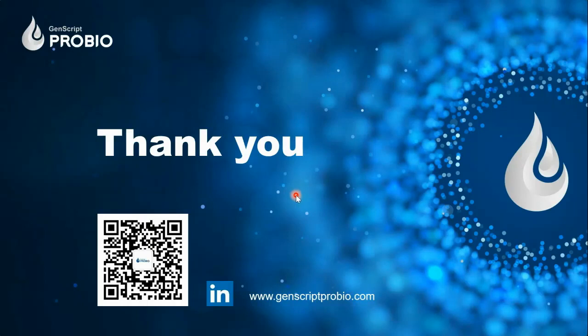Okay, thank you, Dr. Ali. The next question: can you illustrate a bit more about your general purification process? I understand that as the downstream part. You start with UFDF, and you use hollow fiber or a cassette.